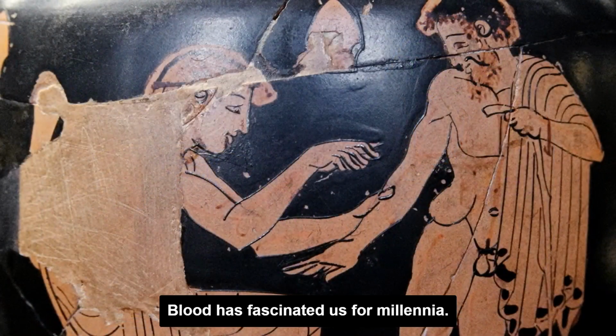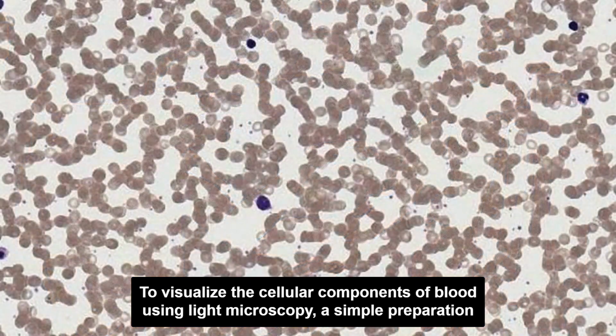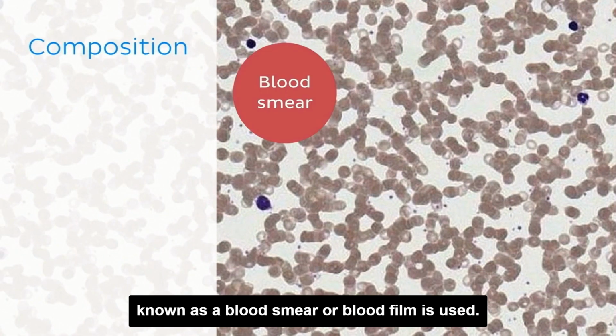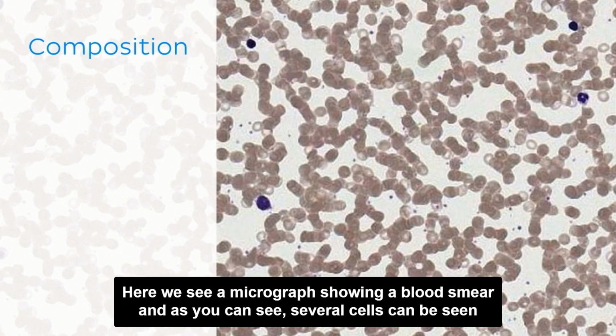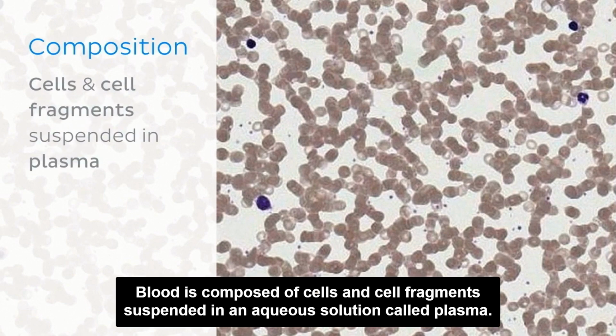Blood has fascinated us for millennia. In ancient Greece, blood was known as haema and was considered synonymous with life. To visualize the cellular components of blood using light microscopy, a simple preparation known as a blood smear or blood film is used. Here we see a micrograph showing a blood smear, and as you can see, several cells can be seen and distinguished. Blood is composed of cells and cell fragments suspended in an aqueous solution called plasma.